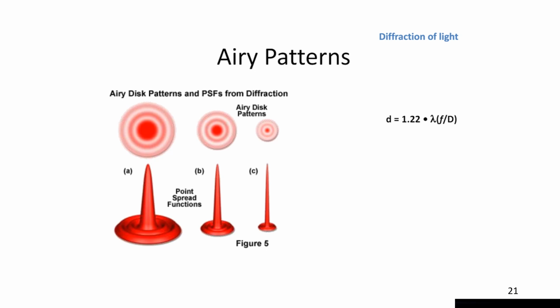For an object consisting of a single bright point in a dark background, the image produced by a perfect microscope, according to paraxial diffraction theory, is the so-called Airy disk, consisting of a bright center spot like this surrounded by a series of rings. The intensity in a meridional cross section through the Airy disk is the same for any aperture of objective or wavelength of light, but its width varies.